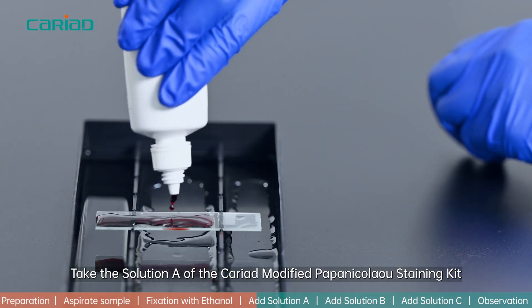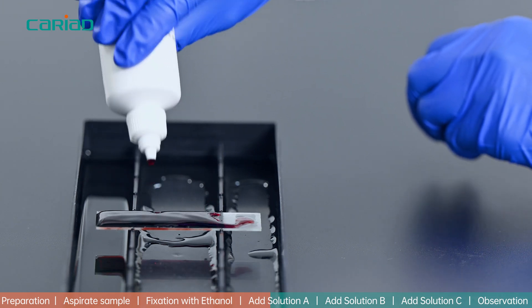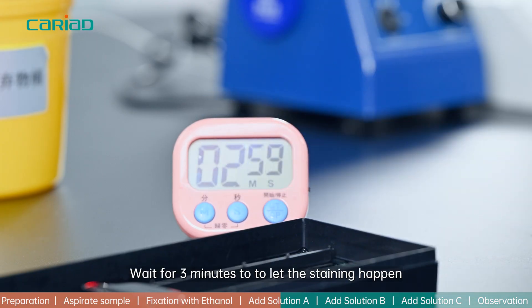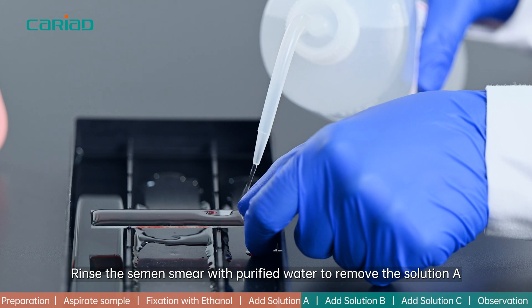Step 3: Take Solution A of the Cariad modified Papanicolaou staining kit and add it on the semen smear, covering it as much as possible. Wait for 3 minutes to let the staining happen, then rinse the semen smear with purified water to remove Solution A.